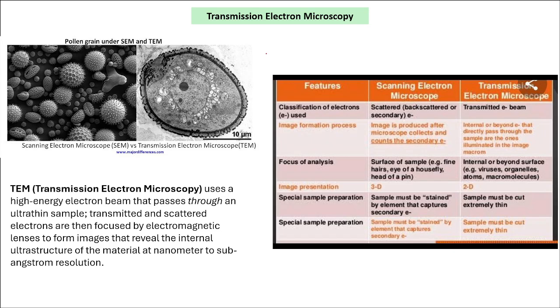Now, moving forward, coming to transmission electron microscopy. What is transmission electron microscopy, and how is it different from scanning electron microscopy?